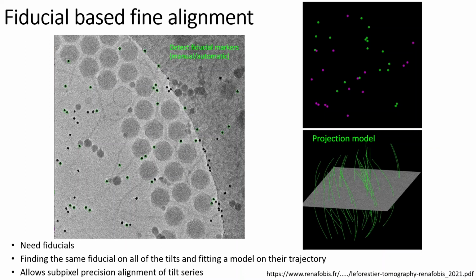If we have samples where we can include our fiducials, that's very feasible to do, because these fiducials are creating very dark spots on our sample, and these dark spots we can very nicely trace or track in our image. So nowadays the programs automatically find these dark spots and then track how these spots are moving in between the tilts.